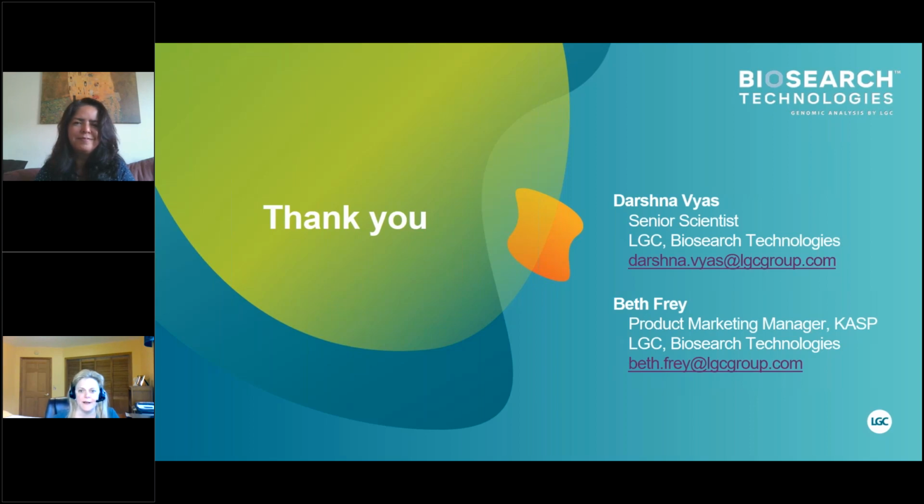All right. Right now we are in the process of KASP assay genotyping development for oil palm. I wonder if you have any KASP genotyping databases or also application for oil palm. We do work with oil palm, and KASP does work very, very well with oil palm.